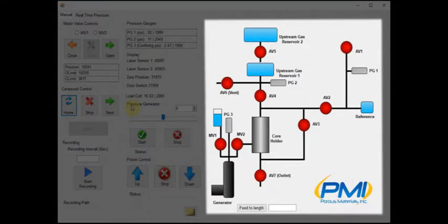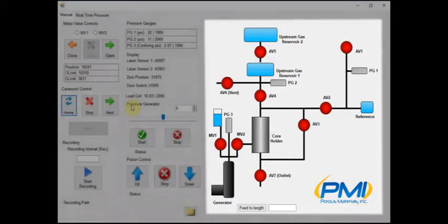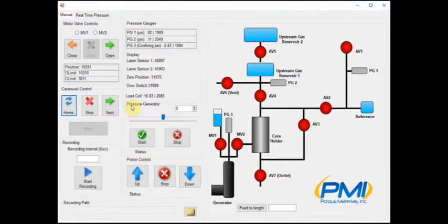Next, we can see an interactive schematic of the plumbing in the machine. With this we can open and close all valves in the machine. Now we will close out of manual control to return to the main menu.